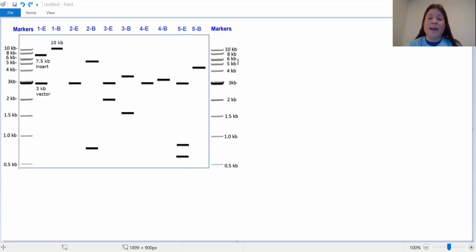So this is the point at which we actually encourage you to fudge your numbers. I'm going to decide that maybe I got that insert size wrong. Maybe that's not 7.5 kb. Maybe that's actually 7 kb. That number will work much more neatly with our BAM-H1 digest, so we'll go with that instead.